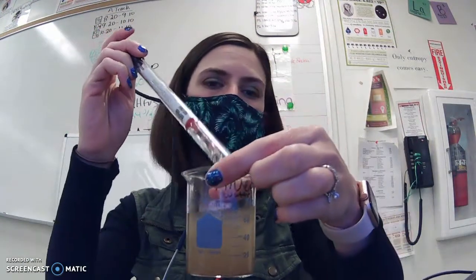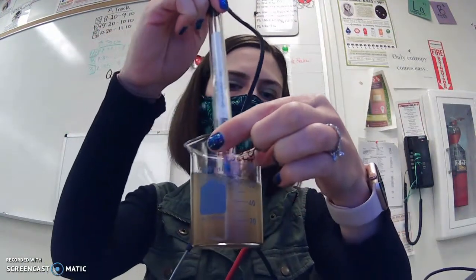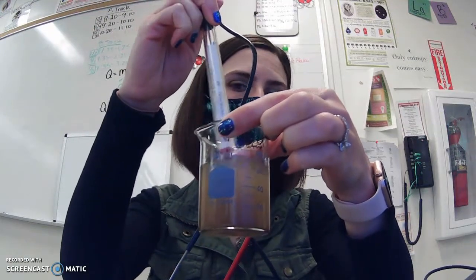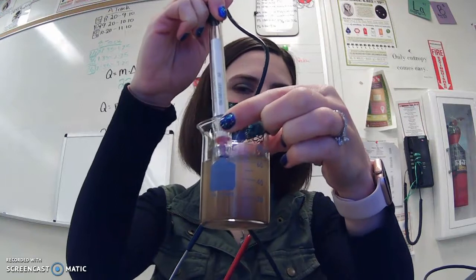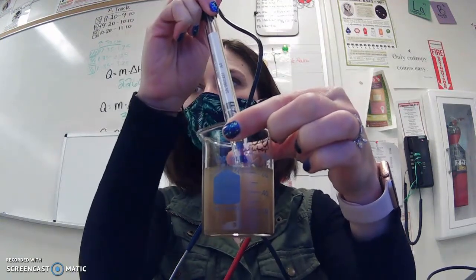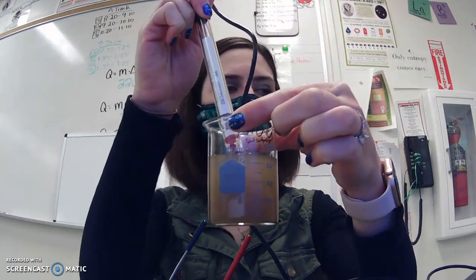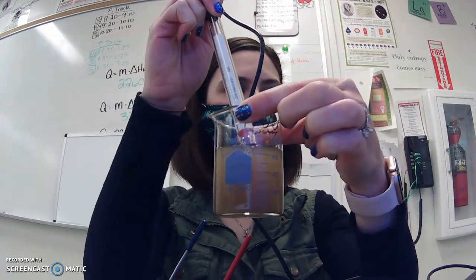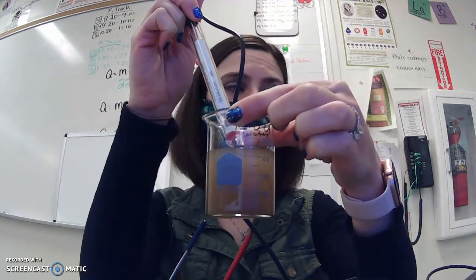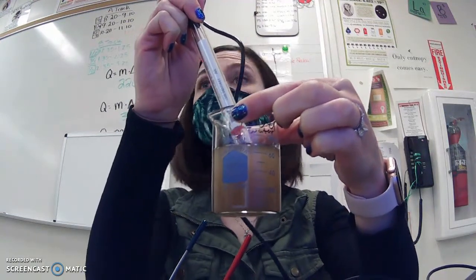And we go into our sample, zero it out. 99.9, 48.2. And you can kind of see stuff swirling around in here. 0.6, so it changes, roughly around 40, so it's saying that there is stuff present.